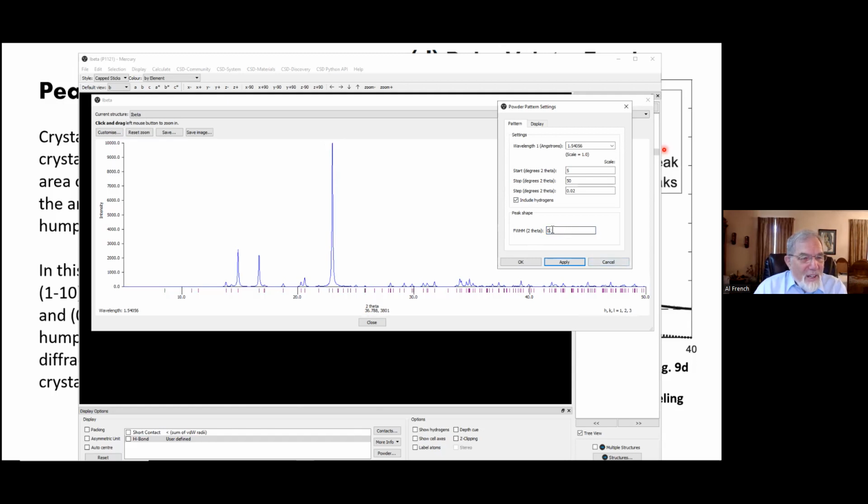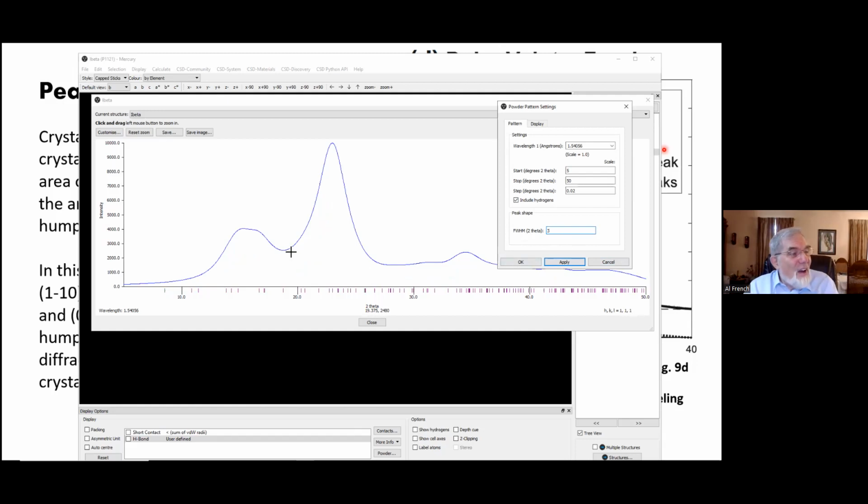If we go to say 0.5 here, now we get up to a height of, let's say, well, it's only 300 counts. So 10,000 minus 300 would be 9,700, or 97% crystallinity. But if we start getting real here, say with our 1.6 sample, now the peaks have overlapped a great deal, and we should be at about 1,000 here. So this is 10,000 minus 1,000 is 9,000. That's equal to 90% crystallinity. And if we go to our wood pulp size pattern here, then this minimum here is at about 2,500, 2,480 it says. So that's 75% crystalline.